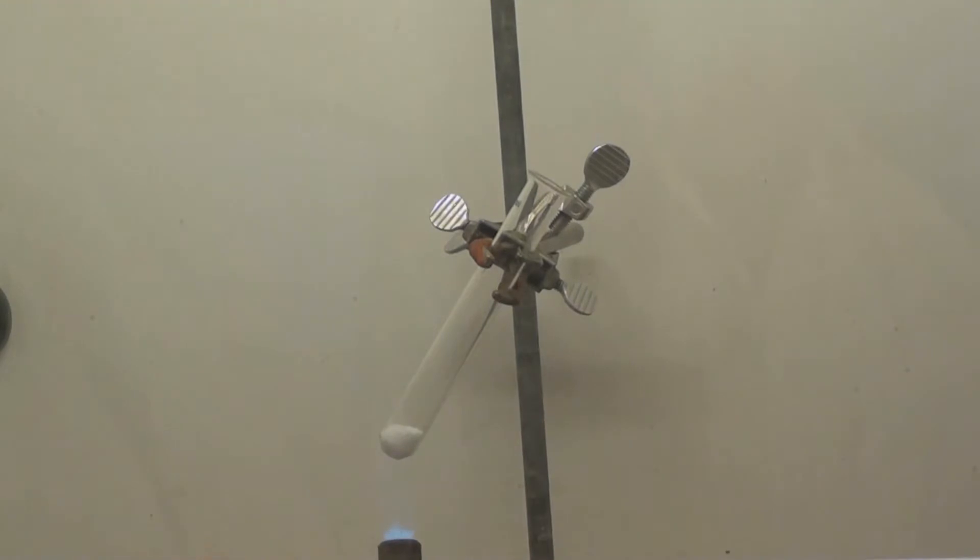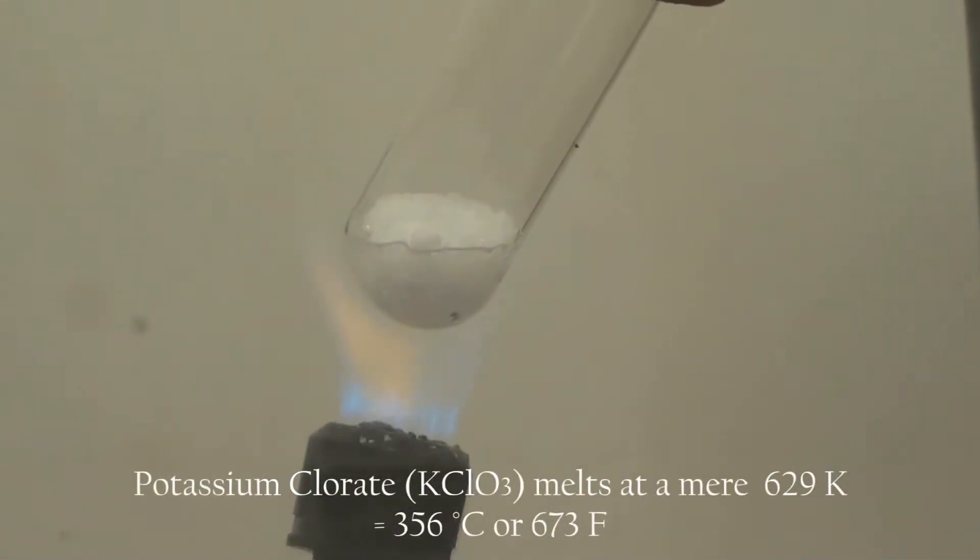We mounted the test tube with an angle of about 45 degrees, to get enough oxygen in without pouring out the chemicals. Then pour the potassium chlorate into the tube and heat it up with a burner until it's liquid.